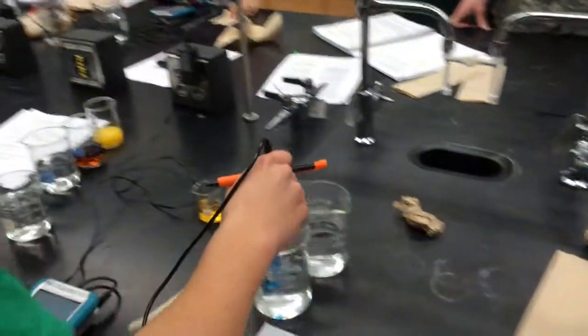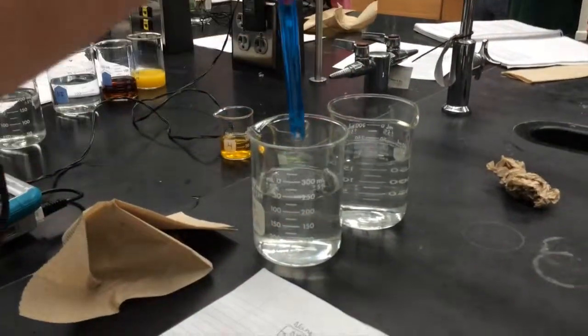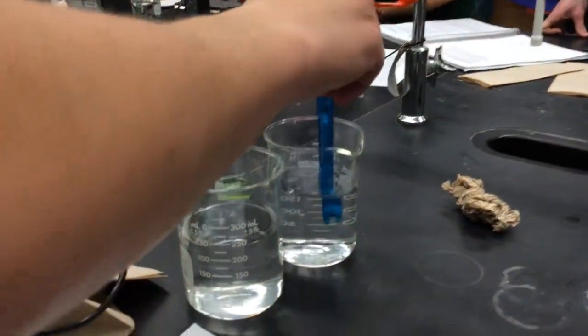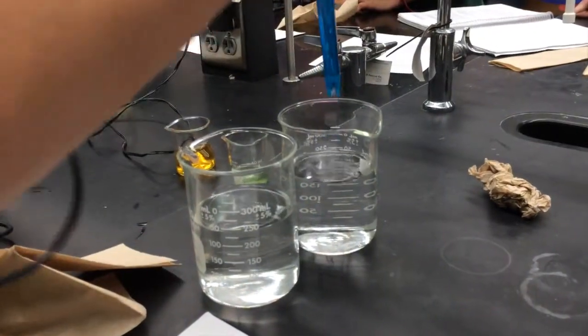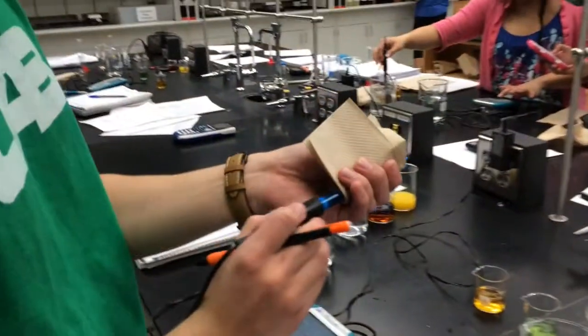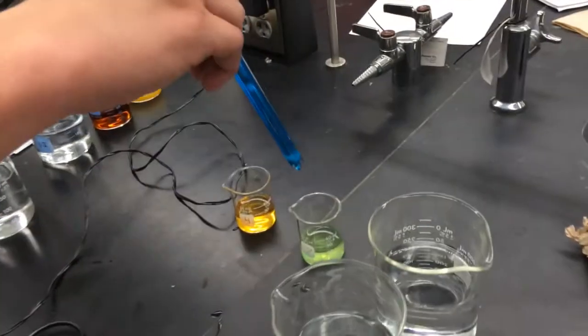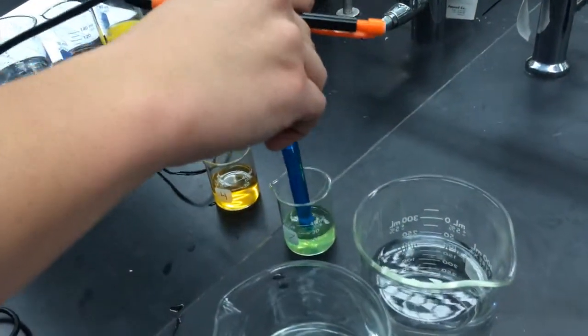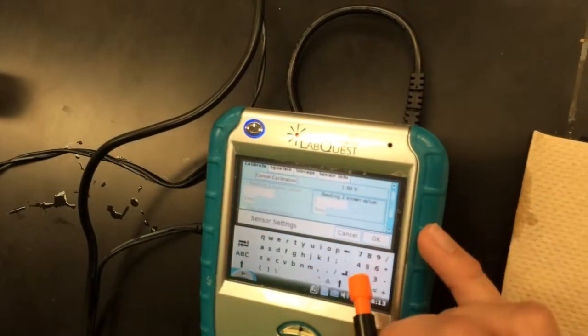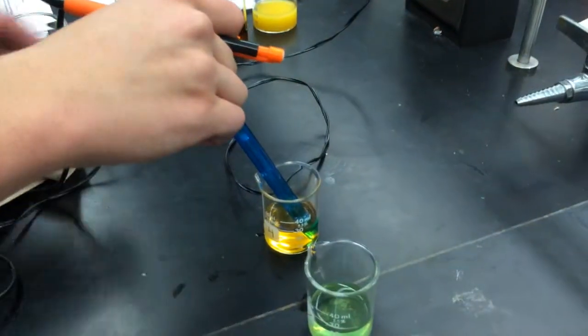Here we can see Ben cleaning the probe to prepare it to obtain the pHs of the 2 buffer solutions. Ben obtains the calibration for the 7 pH buffer, and now for the 4 pH buffer.